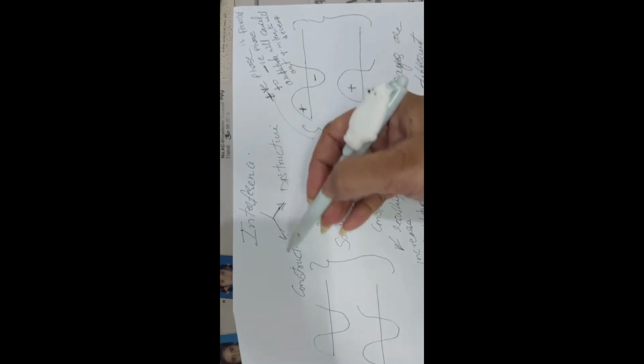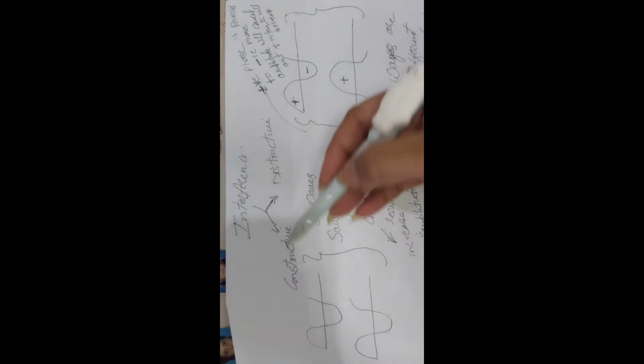This can be shown here on the paper. I can show it to you right now. Here in this figure, you can see interference divided into two ways, constructive and destructive. Here you can see the behavior of the wave. If the two waves are in the same phase, they interfere constructively, resulting in an increase in amplitude and intensity.